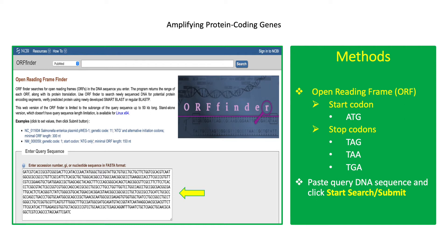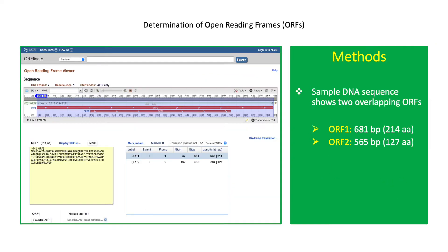If the gene of interest is a protein-coding gene, one will look for the start and stop codons. Paste the DNA sequence into the query text box and click Submit. In this example, a DNA fragment sequence shows two overlapping ORFs.